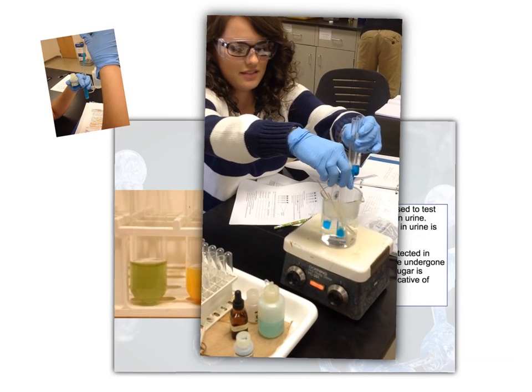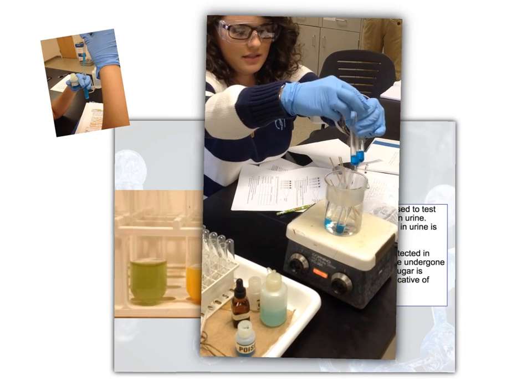Put all this over in them? Yeah. And you know it's 0.5 milliliters. What do you put, 1 drop?